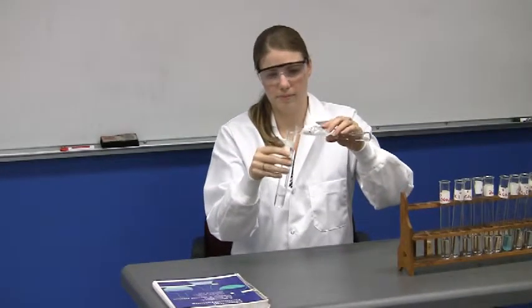So anyway, what the students are supposed to do in this assignment is, the first part is to complete and balance each equation. And so let's go to the first combination of test tubes. This is HgCl2 in test tube 1 and Na2CO3 in test tube 2. So if you'll combine those.